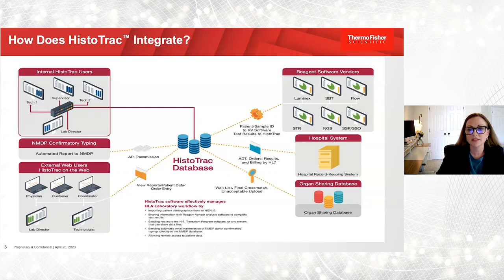And then lastly, down here, it's just an interface with organ sharing databases. So in the States, that's UNOS or UNET, CBS for Canadian folks. And so we do have various pieces and functionality that will connect HistoTrac back to UNET.